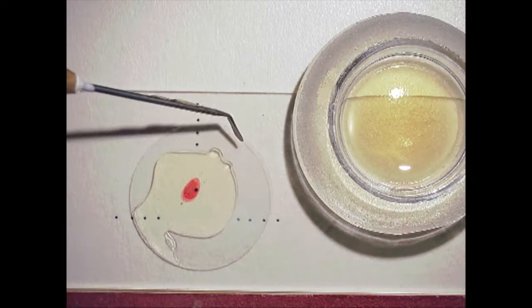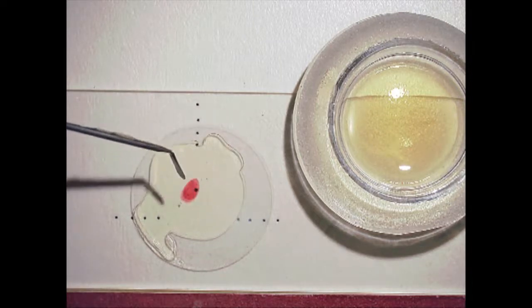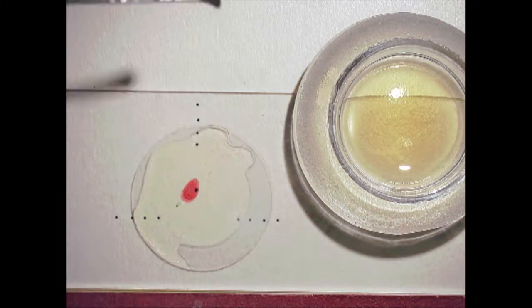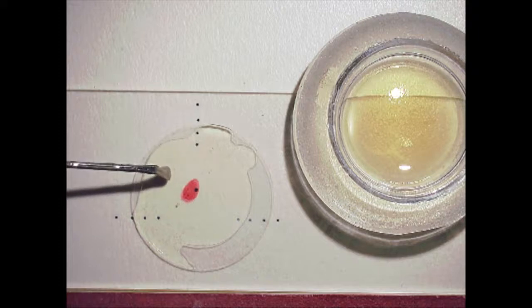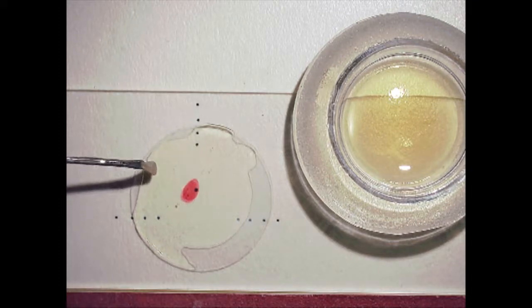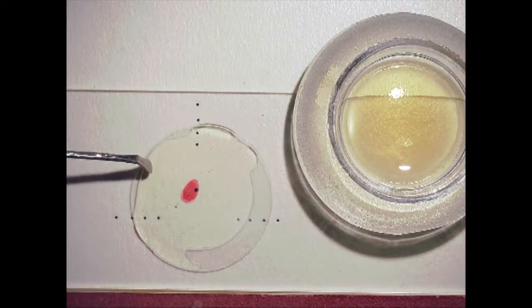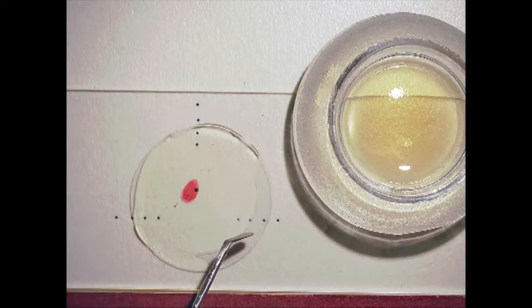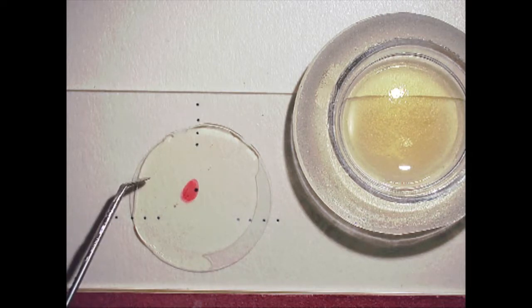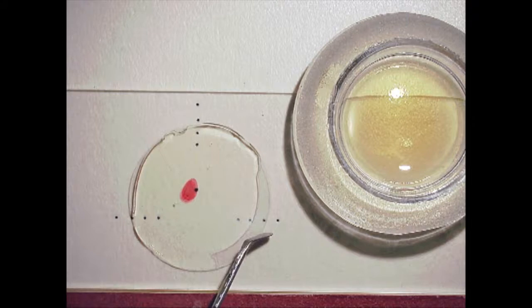And gently move this down. As you can see here, my specimen is turned slightly, but it's still nearly center. So again, I'm kind of tapping that cover slip down slightly. You'll see the balsam gradually moving under there. It's almost filled. The viscosity of this balsam could have been thinned maybe a little bit. And balsam can be thinned with substances such as HistoClear. That's a citrus derivative.